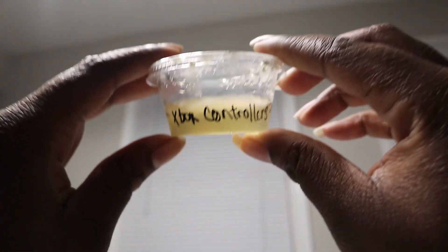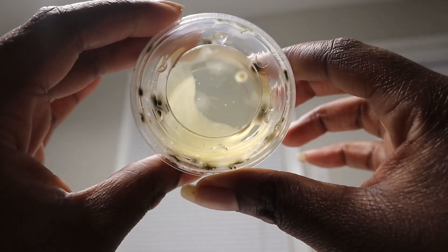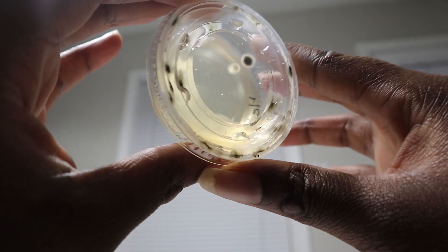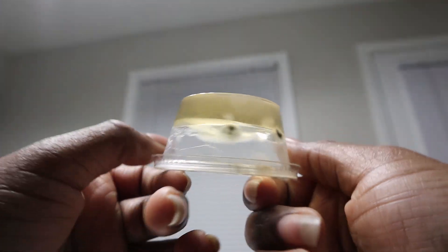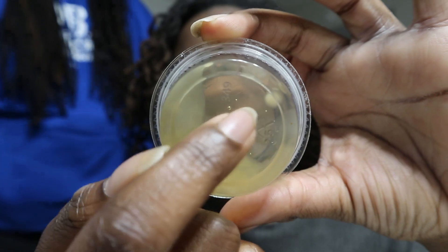The second one was the Xbox controller — I swabbed the part where our hands go the most. It does have some turbidity. I'm not sure if it's bacteria or what, but this part is turbid and this part is clear, so this part didn't have any substantial growth.